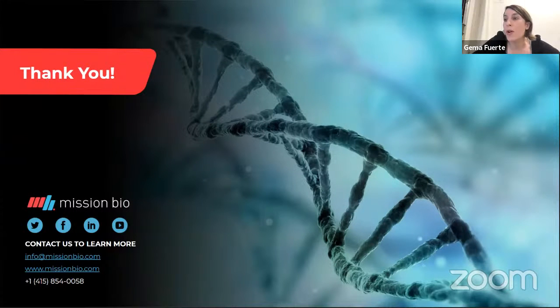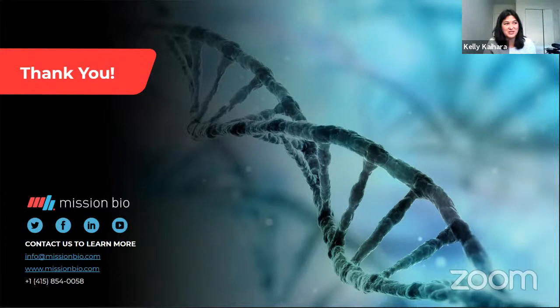Or you can use a different method like inverse hyperbolic sine, which is similar to FACS, to flow cytometry. For those familiar with flow cytometry analysis, that can be used too. I'd also like to mention that in the Jupyter Notebook, we have a third normalization tool that is specific to Mission Bio and was created by our bioinformatics team. You can also explore that third normalization tool in the Jupyter Notebooks.